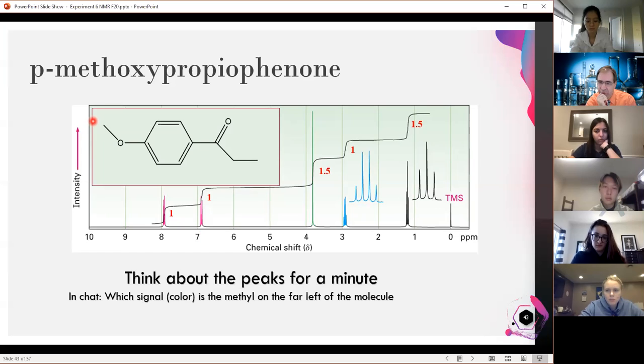All right, blue, green, green. We're getting a little more greens here. Let's think about it for a second. First of all, what are the two options it can be? I said it was a methyl, right? So let's look at our integration.